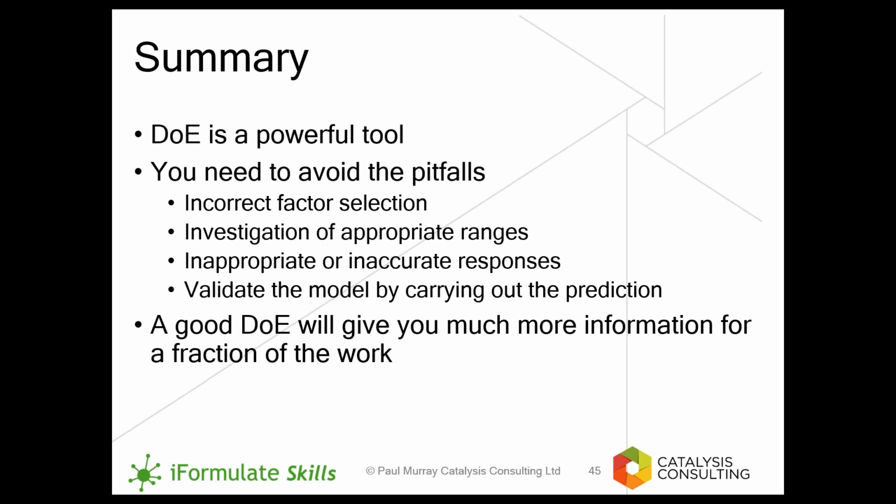And so a value of 0.000 is the completely homogenized. A value higher than that means that some of those components are not completely blended and uniform, and you can still see them discretely. So you're using multivariate analysis to look at that. It's not a simple calculation, but it is something that's typically done for this. If you've ever used something like ReactIR to monitor a process, that's what's going on, and you're looking at that change going from 0 to 100%.